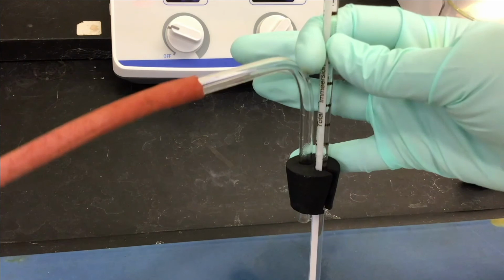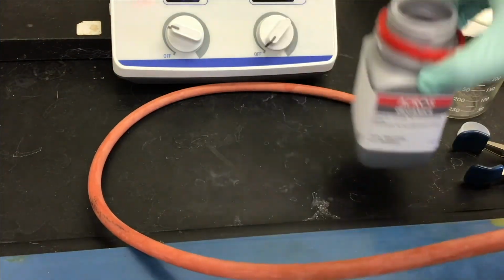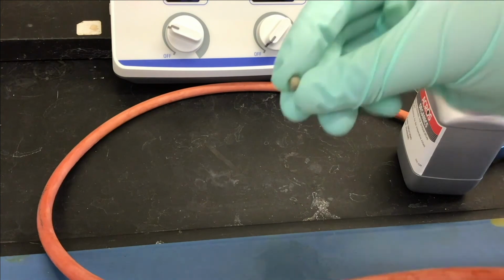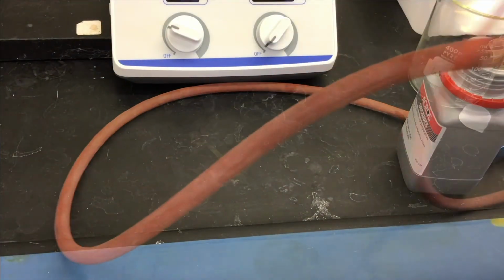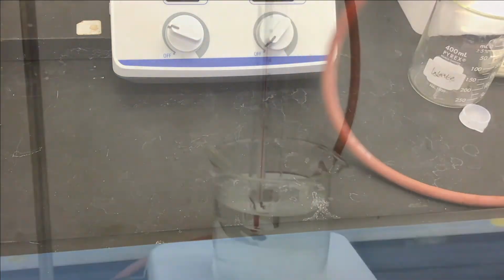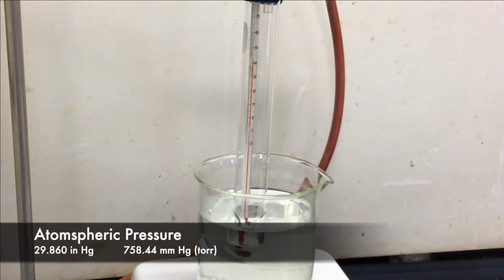The hole with the slit will be fitted with our thermometer, and the second hole will be fitted with a right angle bent glass tube with rubber tubing to drain. Next, we're going to put 2 boiling stones into our test tube. Then we're going to stopper our test tube with our prepared 2-hole rubber stopper and thermometer.